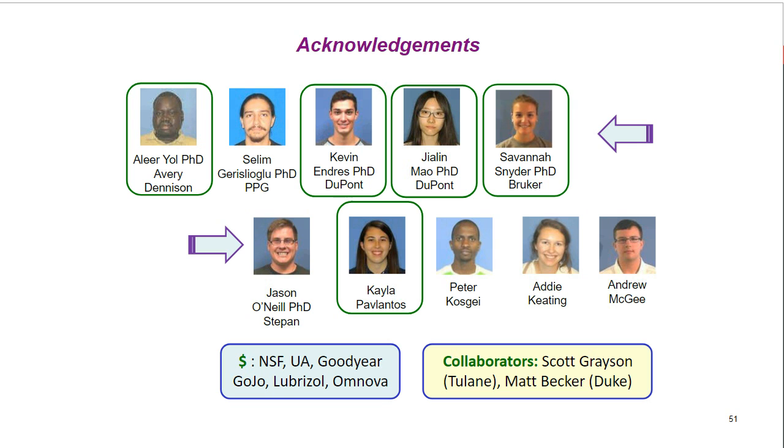You still are going to get information about the end groups, about the derivatization, the reaction, like the answer I gave before. You can use MALDI for those things. You just cannot use it to determine average molecular weight and polydispersity if it's broad. But everything else you can still do. The compositional analysis you can still do. The end group analysis you can still do. And actually in my talk I showed that with the polyethylbutylene. We couldn't measure the average molecular weight, but we could still determine the end group.